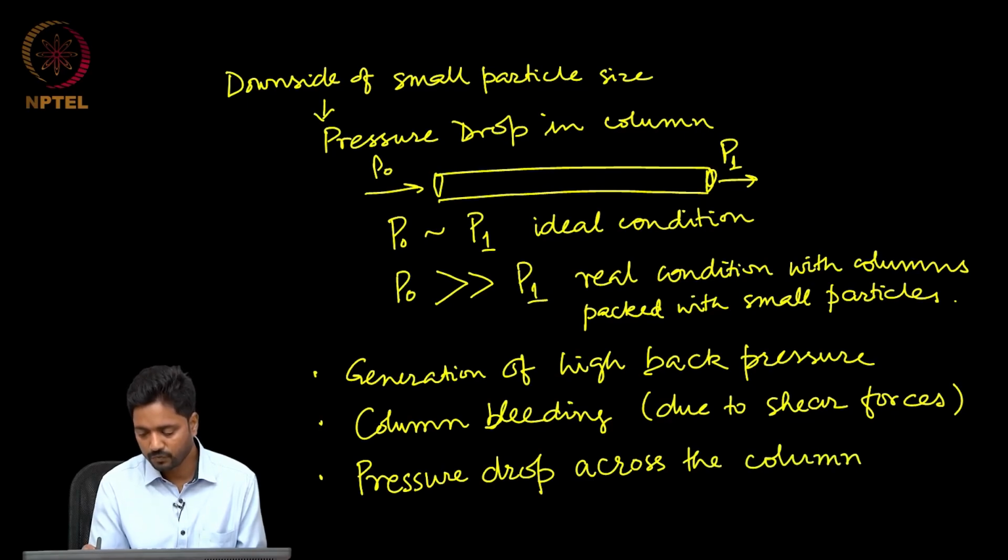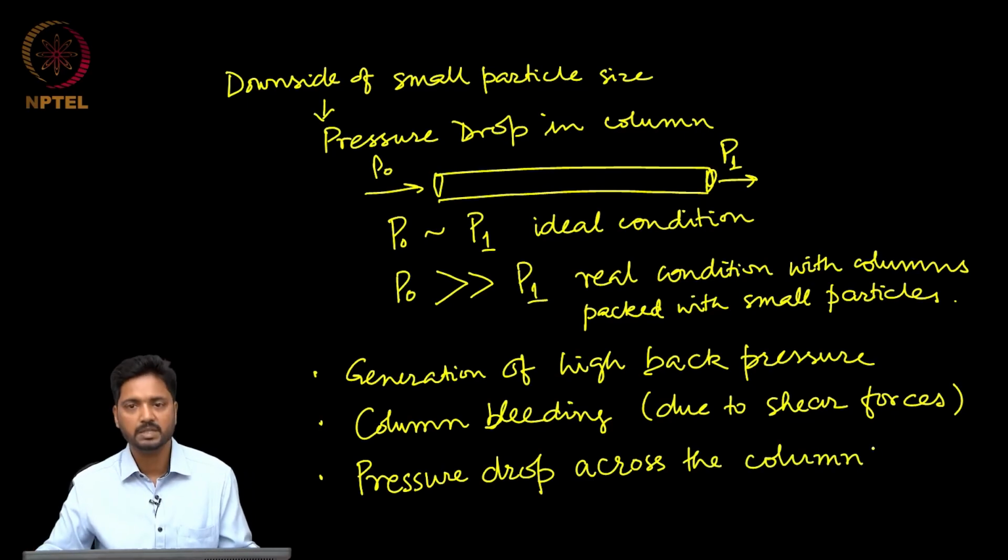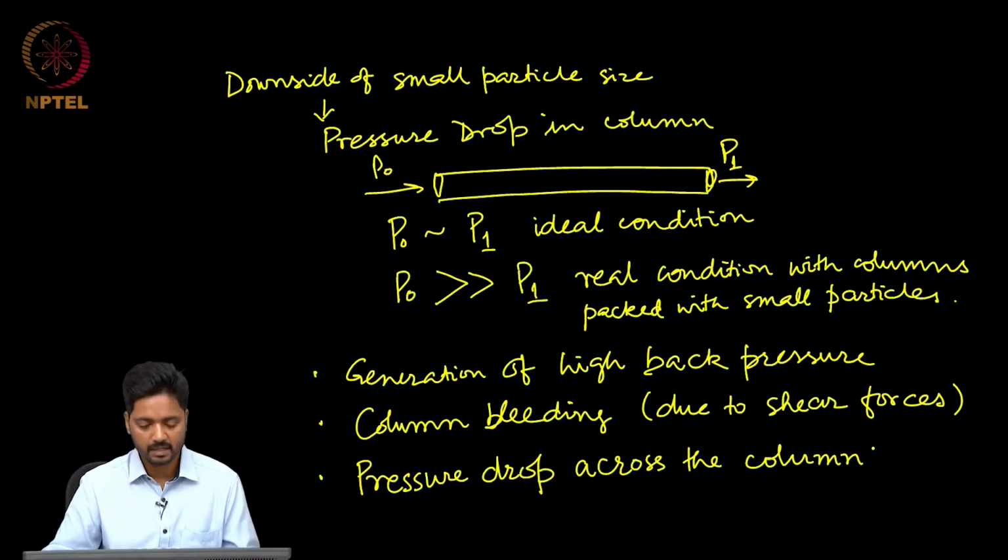All of these need to be taken into consideration when utilizing smaller particles for packing chromatographic columns, and one needs to be very careful that the pressure rating on the pumps is never exceeded, otherwise our pumps that pump the solvent or the mobile phase into the column will start undergoing rapid performance decrease.